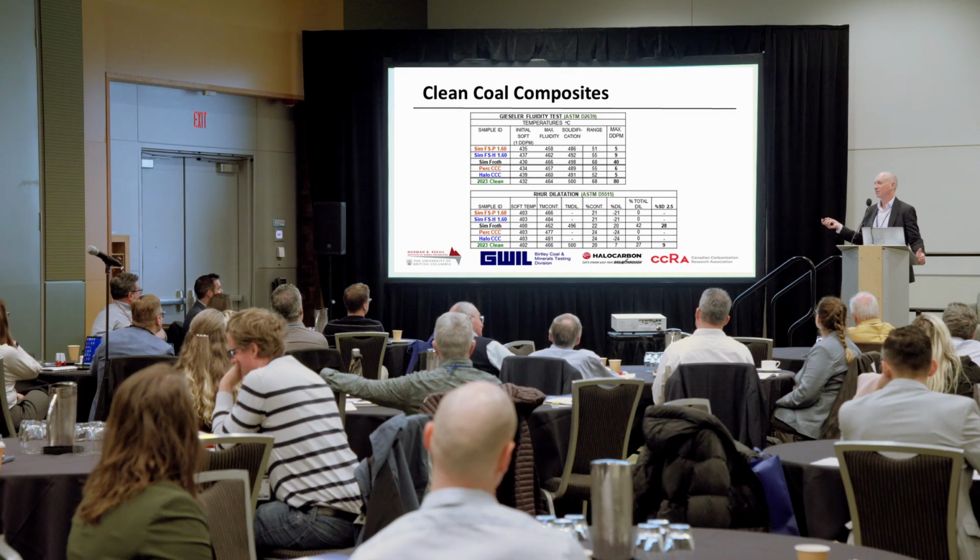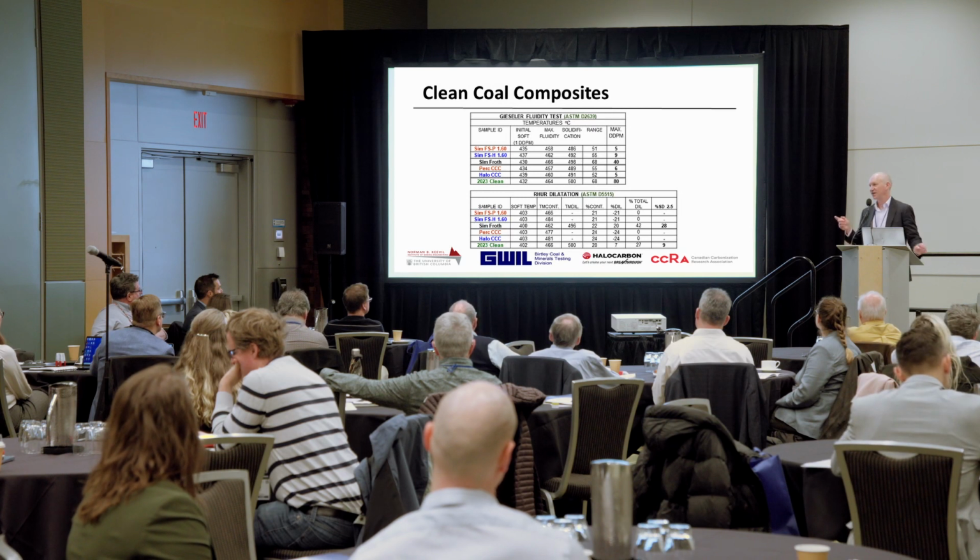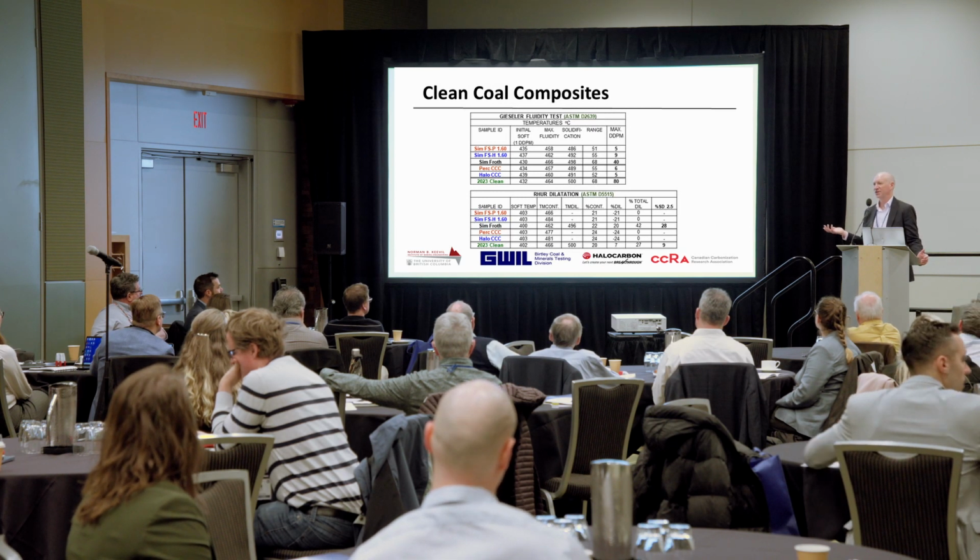The DDPM, for historical reasons, I get it. The DDPM is dial divisions per minute, so it's not really a material test, but it's a test that's recognized in the world. So what happens is coal goes into a cylinder, and then on the cylinder it's got like a little, I'll say, piston sticking out the side. They heat it up, and then as it gets soft, it starts to spin. So there's 100 dial divisions in 1 DDPM.